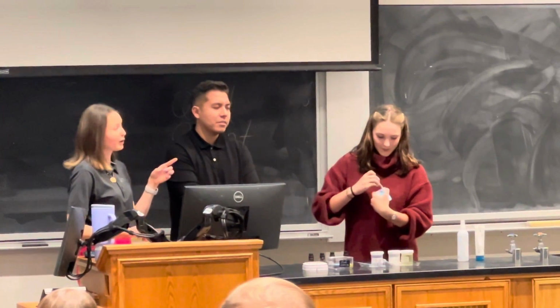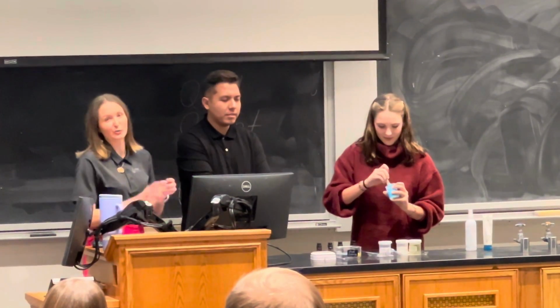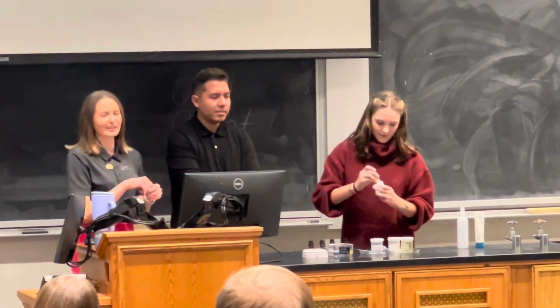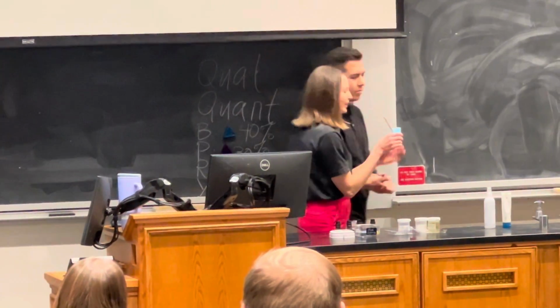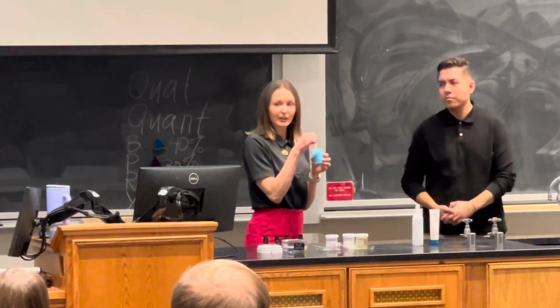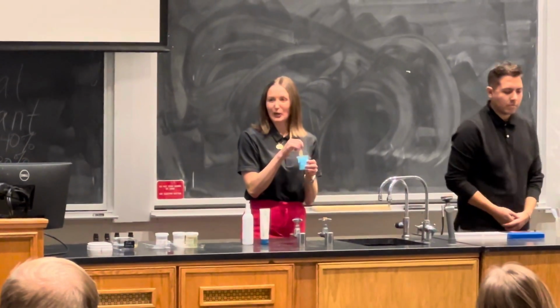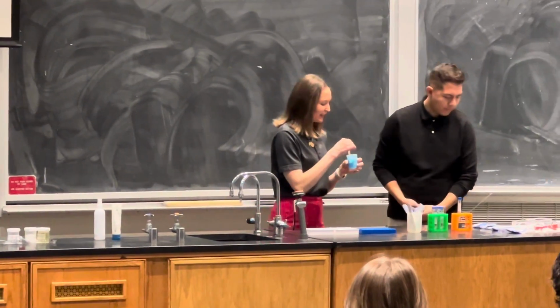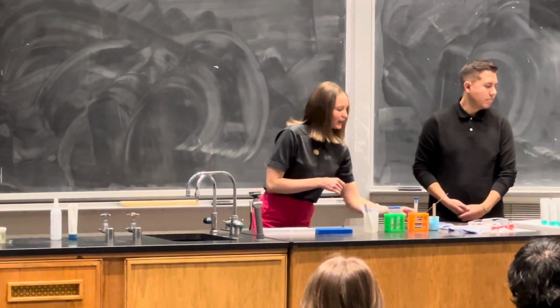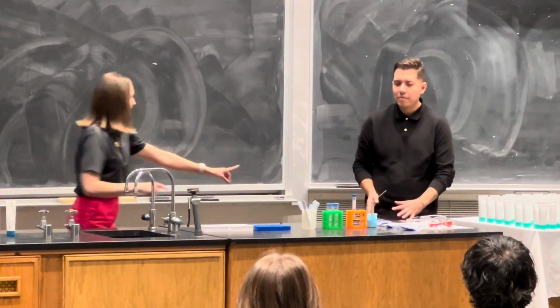Often when you're doing product development, you're making tons and tons of batches where you're exchanging different ingredients until you get the perfect product that you want. Thank you so much. Okay, you can see that. Now this is ready to send to your lab. You're going to mass produce it and send it to your lab for some development, which is gonna be me. I'm gonna develop a method for this, and then our analytical chemist, after I go through the development process, is gonna come up and extract it. So stay right here, because you're gonna help with the next one.